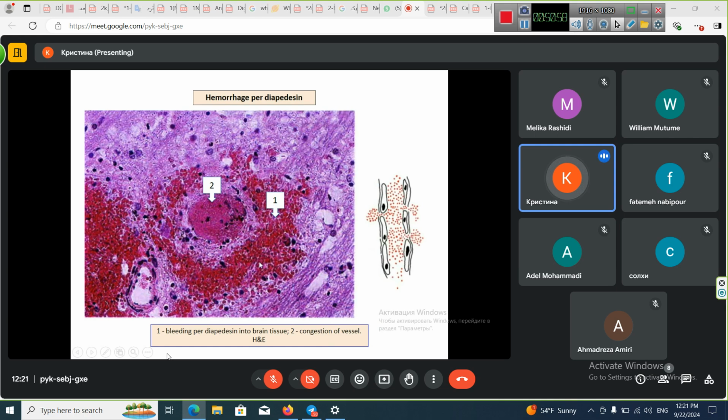So here we have these blood capillaries. So actually this area, lighter stained, between the erythrocytes inside blood capillary and erythrocytes number 1 here, this area is actually the wall of the vein or a venule.